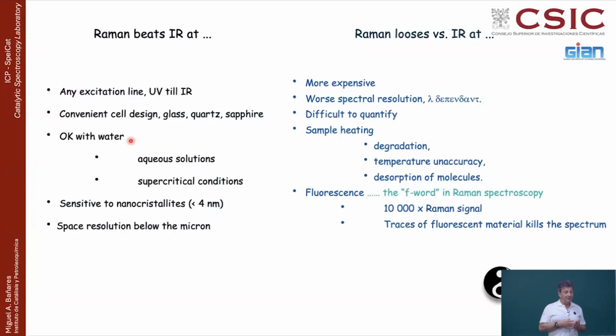And Raman typically doesn't care about water. Water has a very weak Raman scattering. So if you are looking at very diluted solutions in water, like a very low concentration, you can see the solutes, and the water will hardly give a problem for you. In the case of infrared, there is a very strong absorption of water. So you cannot really study water chemistry that easily. You can, but you have to work in the few microns close to the detector. You cannot use absorption infrared, but different things. But Raman doesn't care, can measure without any problem.